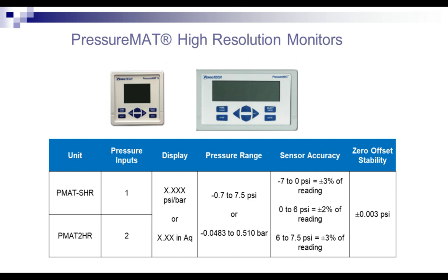The pressure mat high resolution monitors that we just spoke of that were used for this particular simulation have been around for quite a few years already, and this is something that we want to make sure everybody knows about. They are available with 1 or 2 pressure inputs, as you can see.